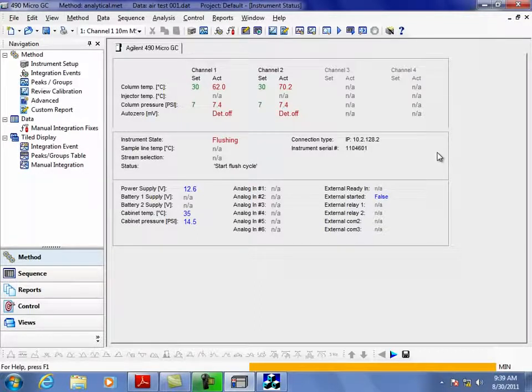Yeah, I noticed that also. I don't know when the acquisition happened. It actually happened in November of last year when it was finalized. That's when they actually folded the two together, but they had been working on it for about a year before that. Then they divested themselves of the Varian GC line, the benchtop GC line, and sold that off to Bruker. But they kept the Varian Micro GC. Okay, that's the reason they didn't know anybody about it. I didn't know anything about it.